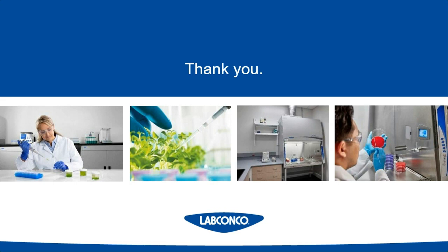HEPA filters in a biosafety cabinet can last 7, 10 to 20 years. It really depends on, one, if your process is generating a lot of particulates or dust, your HEPA filters are going to be used much quicker. Or if your labs are very dusty or dirty, the HEPA filters are going to not last quite as long. But in a general cell culture lab, I would say you could expect 7 years or more out of your HEPA filters. As far as the maintenance, biosafety cabinets are certified usually on an annual basis.